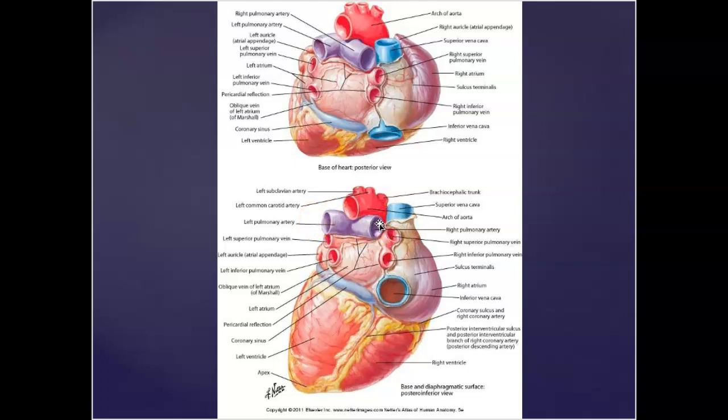Okay, so here's the thing though. You want to try to cut that without cutting off the left atrium. You want to be able to cut these pulmonary veins before they enter the left atrium. But they're holding it quite tight to the back of the pericardium, so it's going to make it a little bit more tricky. So make sure, our rule here is that the one holding the scalpel is the one doing the cutting. So make sure that you're not holding something out of the way, expecting someone else to miss your finger.